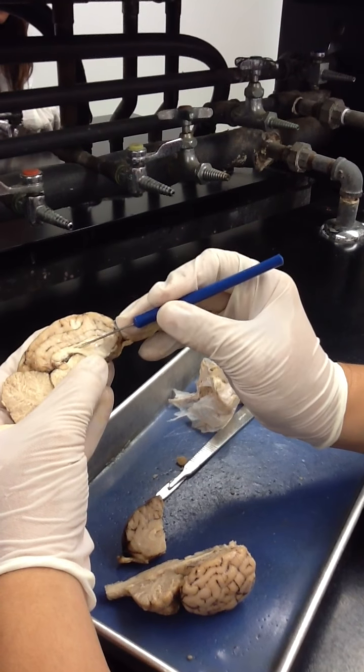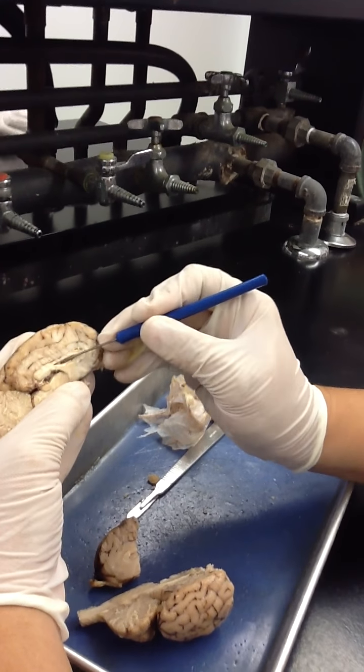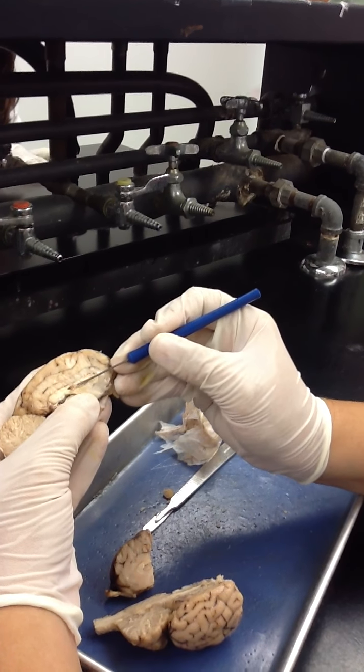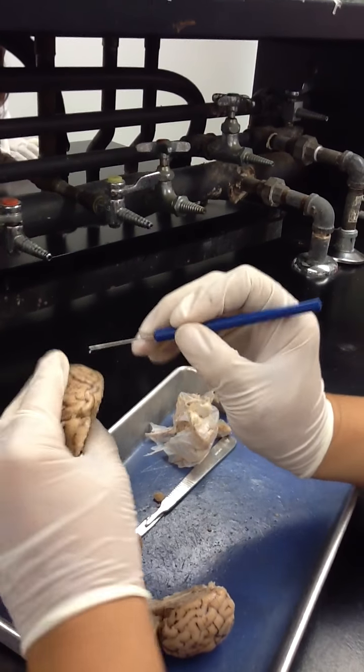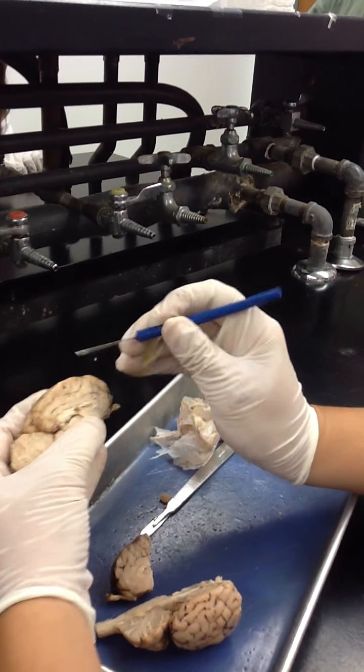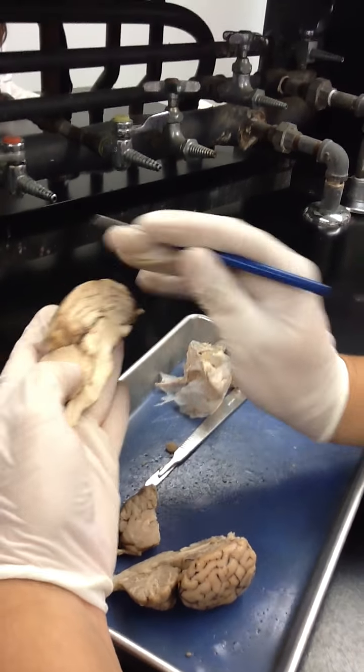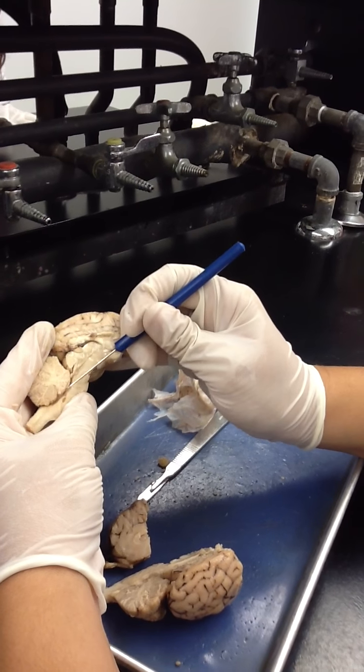Right below the corpus callosum, there's going to be a space that goes into your ventricles. The ventricles are located inside of your brain on the cerebrum. We call them the lateral ventricles. And there's a third ventricle that's located right here, and then the fourth ventricle, which is located right here.